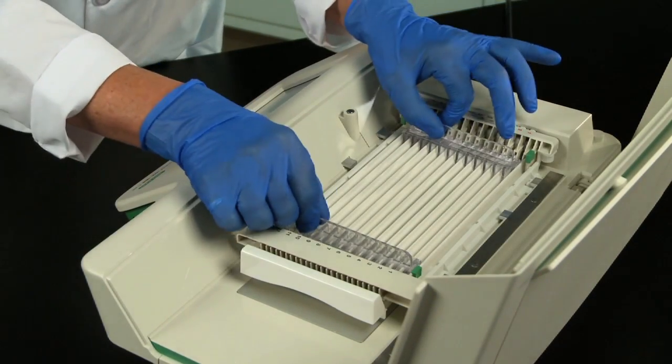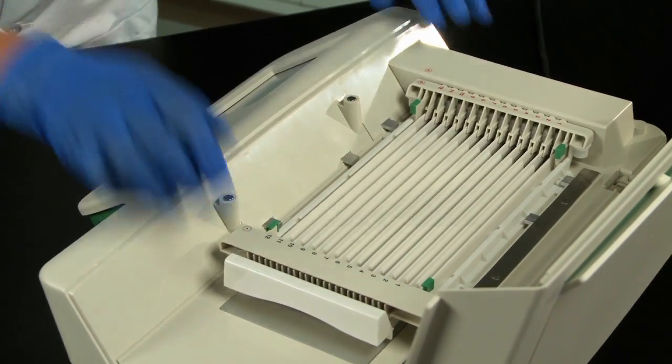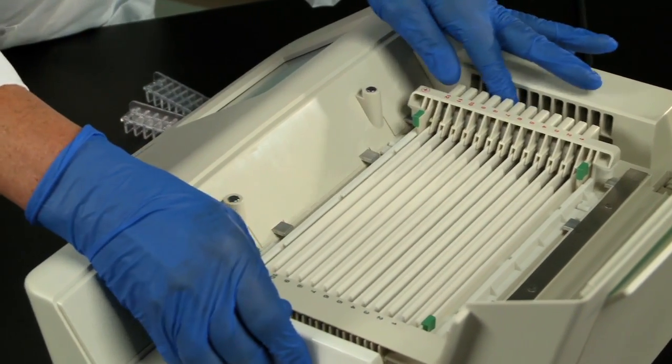After the run is finished, the tray can be removed by sliding it away from the electrodes and lifting it out of the instrument.